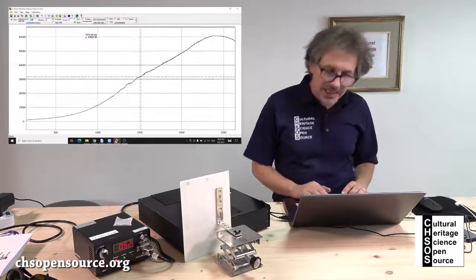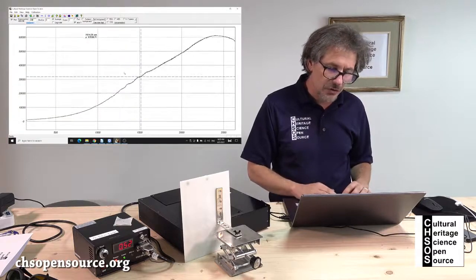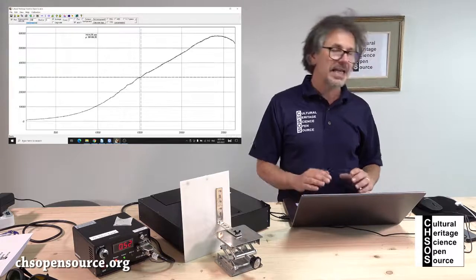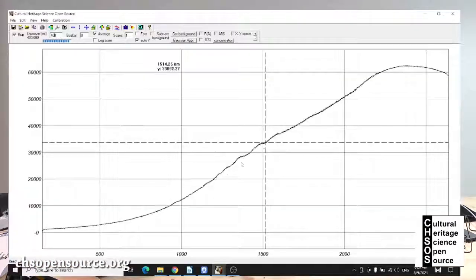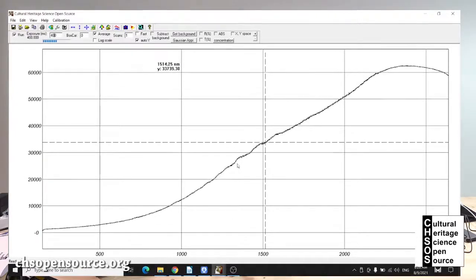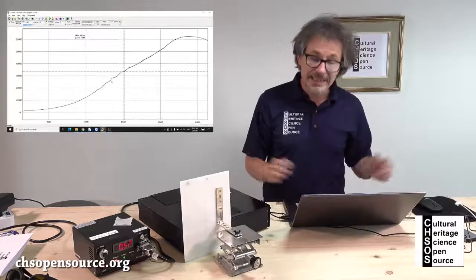And over here we start in the middle of the spectrum. You see, if you see my mouse on the screen, we start to see something like peaks. So there is some specific signal, but you see the peaks are not really well defined. So this is a case where we can actually close the slit in order to get a better signal, the shape of the peaks more defined. Okay, let's see it in practice.